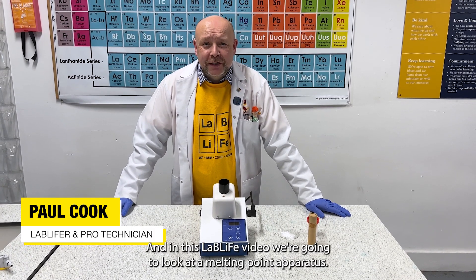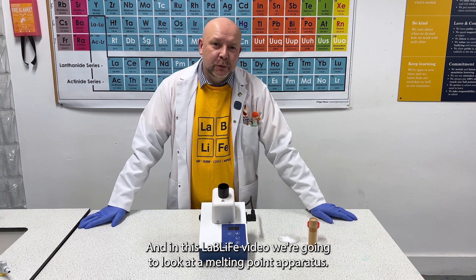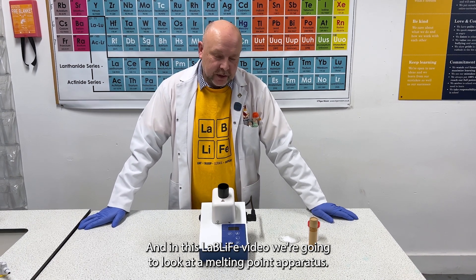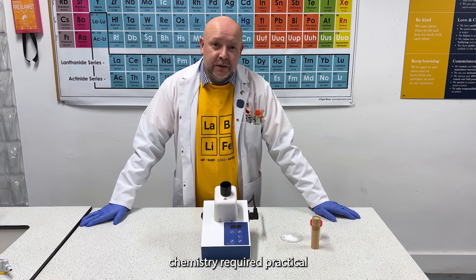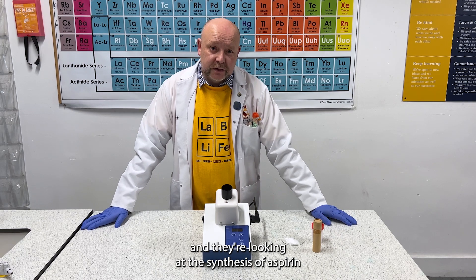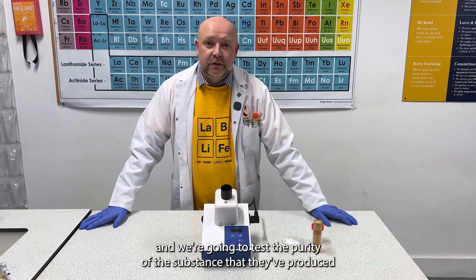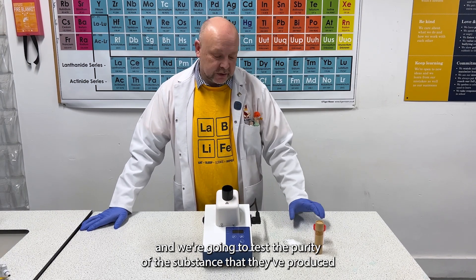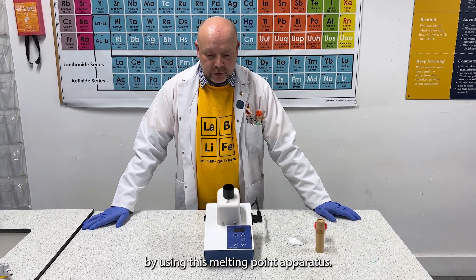Hello, I'm Paul Cook and in this Lab Life video we're going to look at melting point apparatus. We've used it recently for an A-level chemistry Clio Practical and they're looking at the synthesis of aspirin, and we're going to test the purity of the substance that they've produced by using this melting point apparatus.